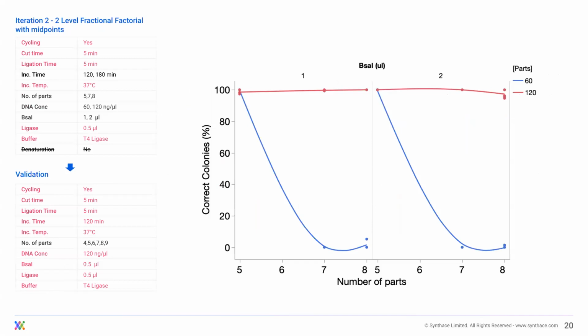So move on to the final iteration that we did. And now you're really boiled down to only a few factors here. We've only got 4 factors and simple plots here. We're only looking at 3 different dimensions. And what we can actually see here is that the concentration of our cutting enzyme was having no impact on the data at all.